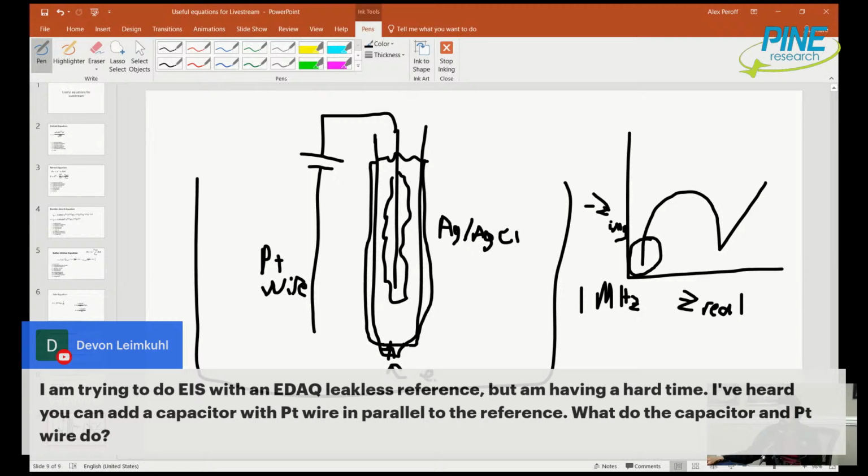It can go through the frit. That's one path for current. It's a very, very small amount of current, tiny. But it can go through here, and that's maybe in the 1 kilo ohm, maybe 10 kilo ohms, of resistance to go through this path. Similarly, there is also another path. Because you have an electrolyte solution, and inside here is silver chloride, potassium chloride, salt typically, you actually have charge. Maybe it's positive here, it's minus here. You have charge in between a dielectric.